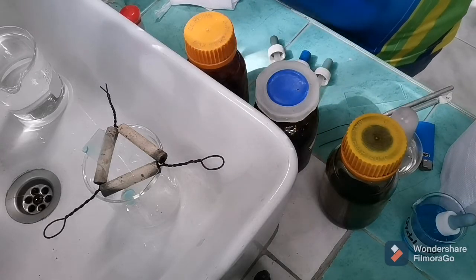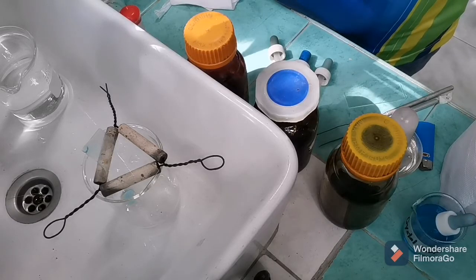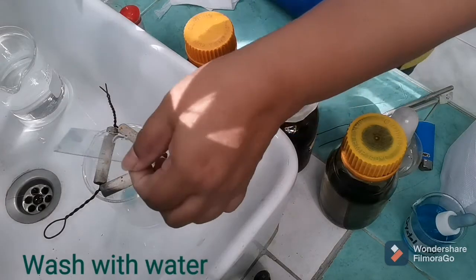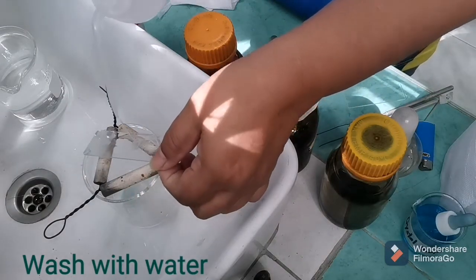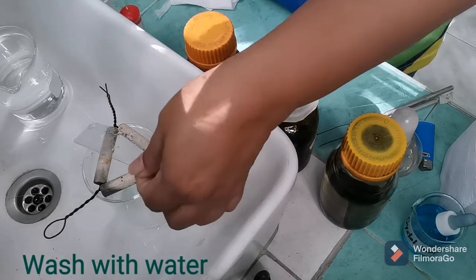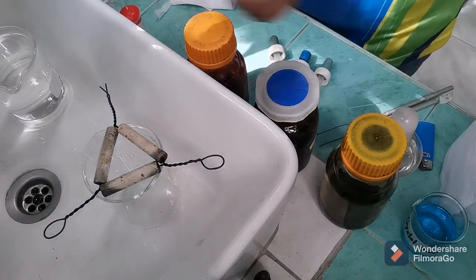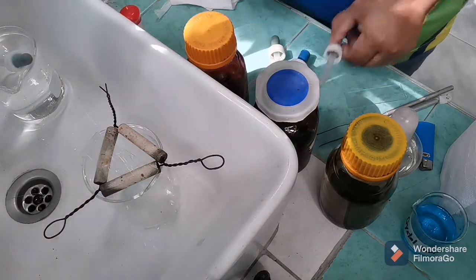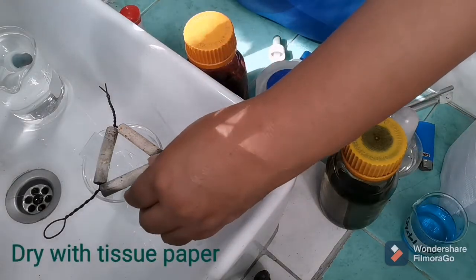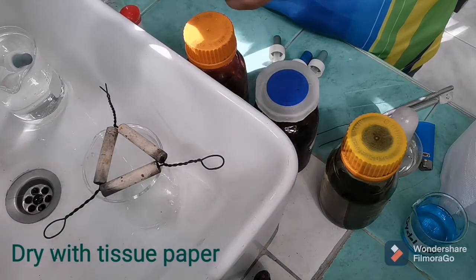After 1 minute, or allowing the slide to be flooded with crystal violet, we wash this using the wash bottle. Okay. After washing, you could tap it with tissue paper, just simply blot in order to remove the excess water.